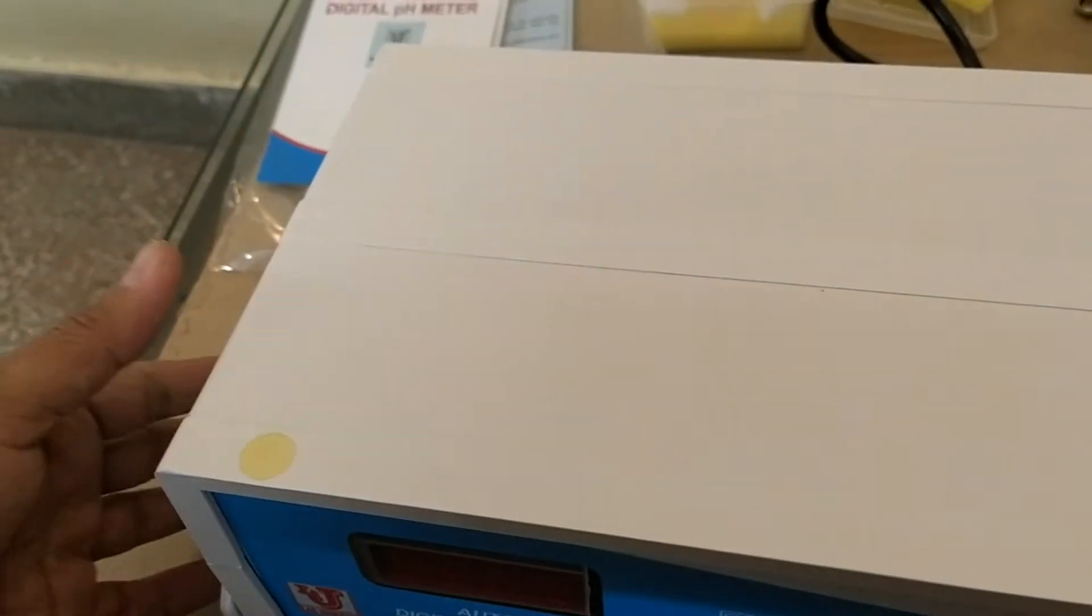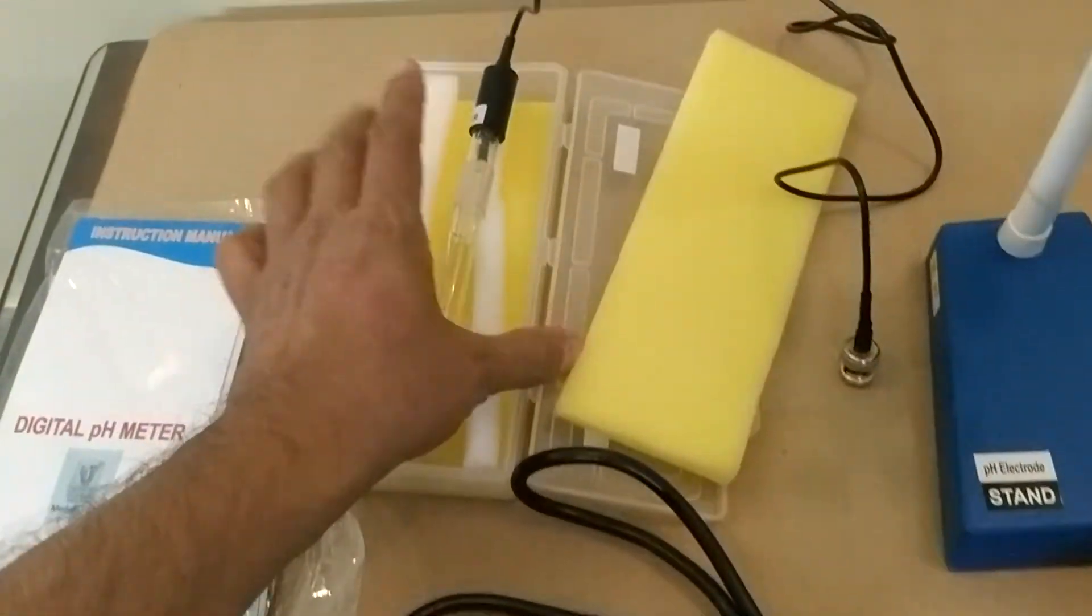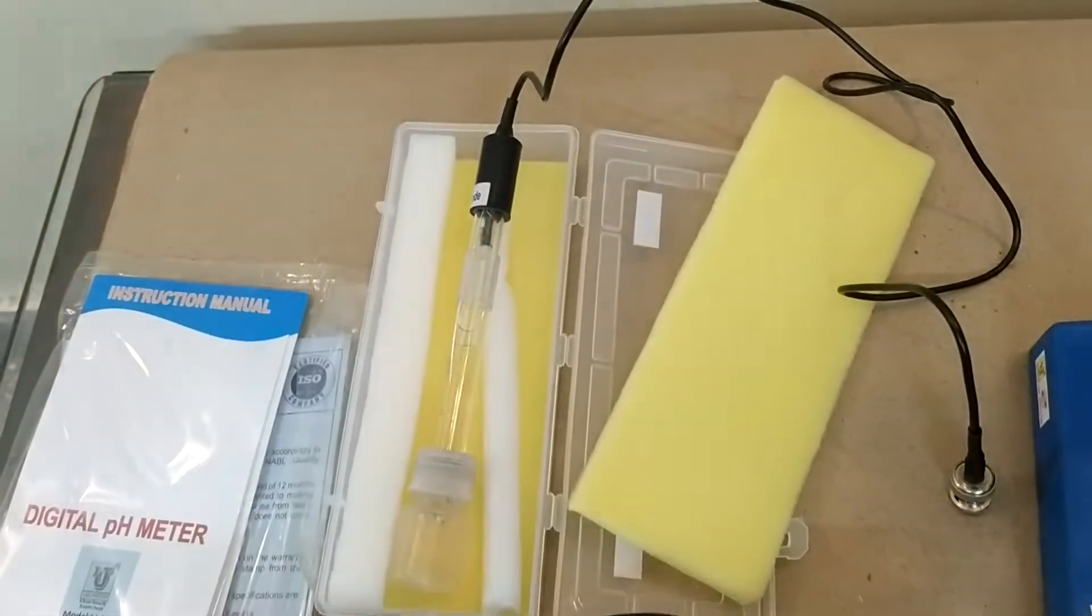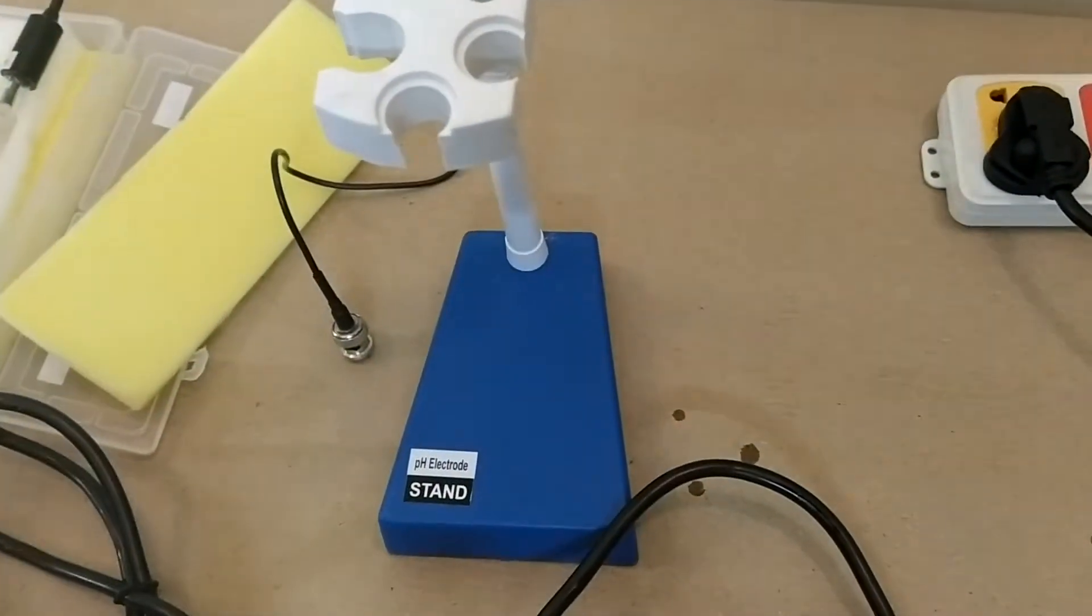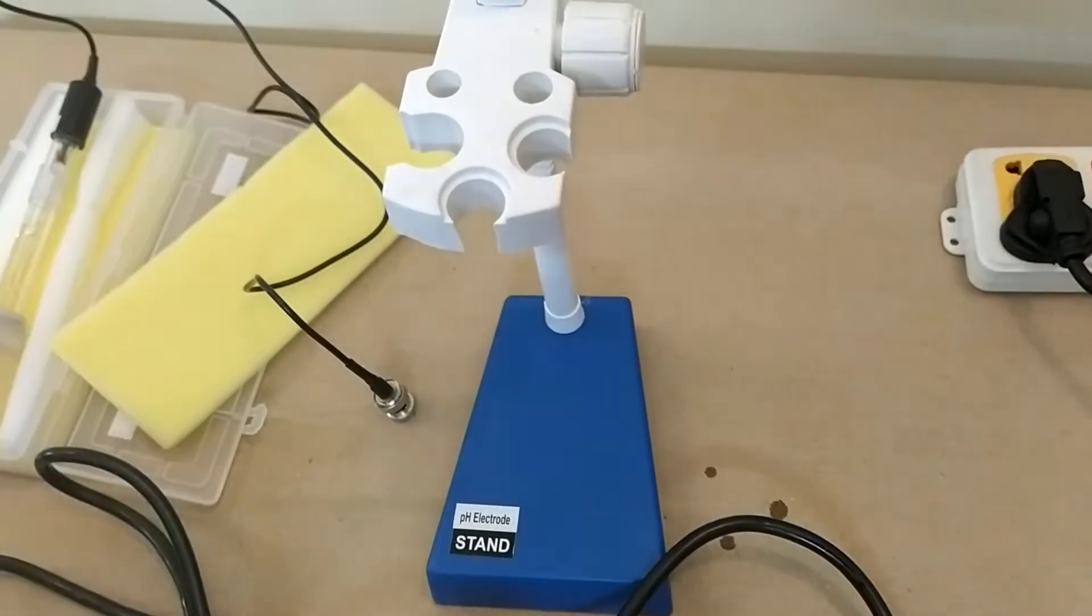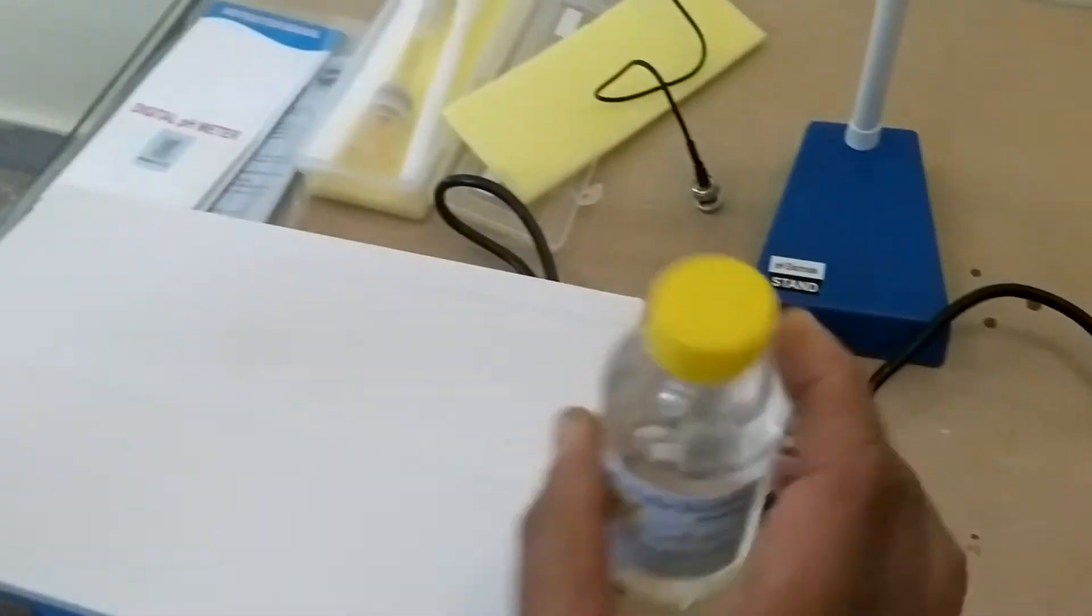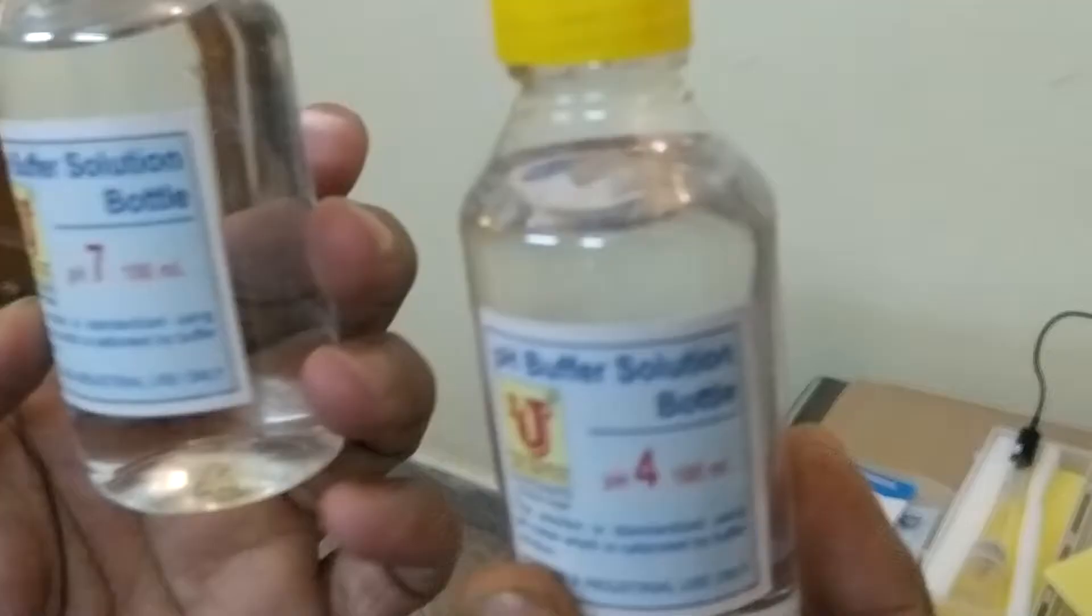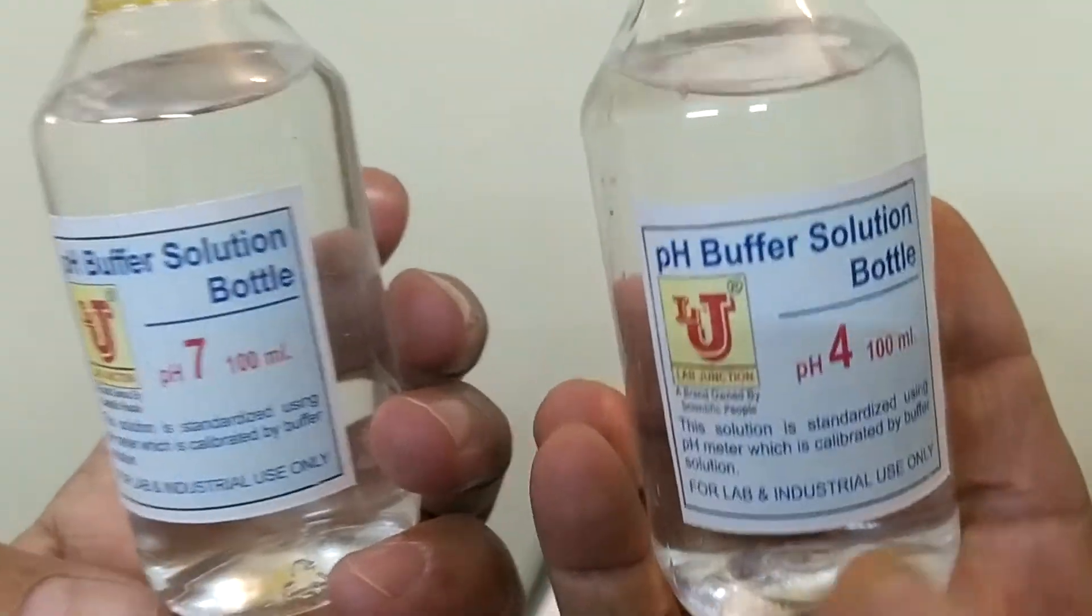In this, one is pH meter, two is pH electrode, third one is stand for pH electrode. And you got two buffers: standard pH buffers, 7 pH and 4 pH.